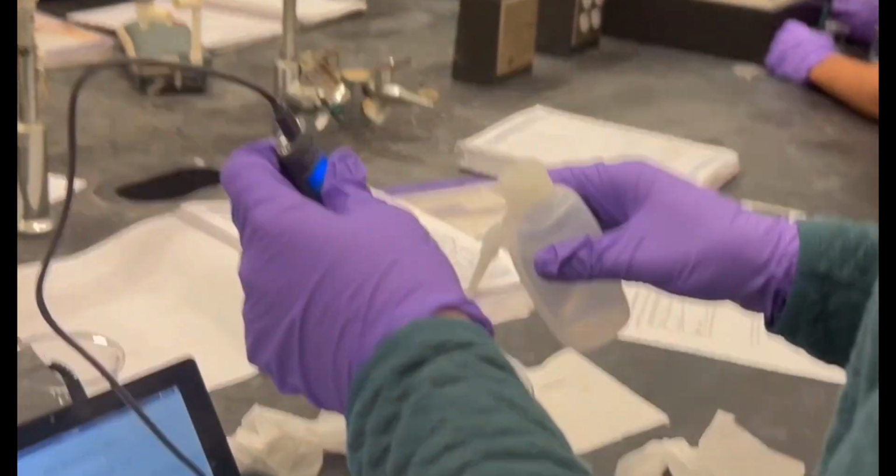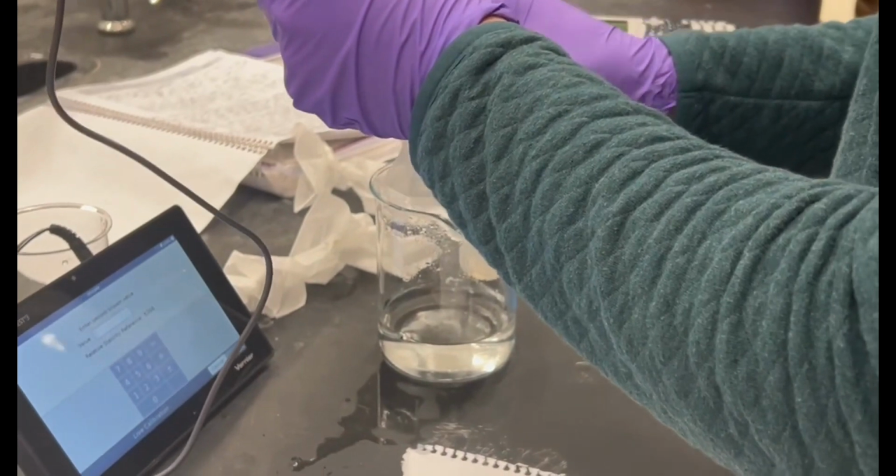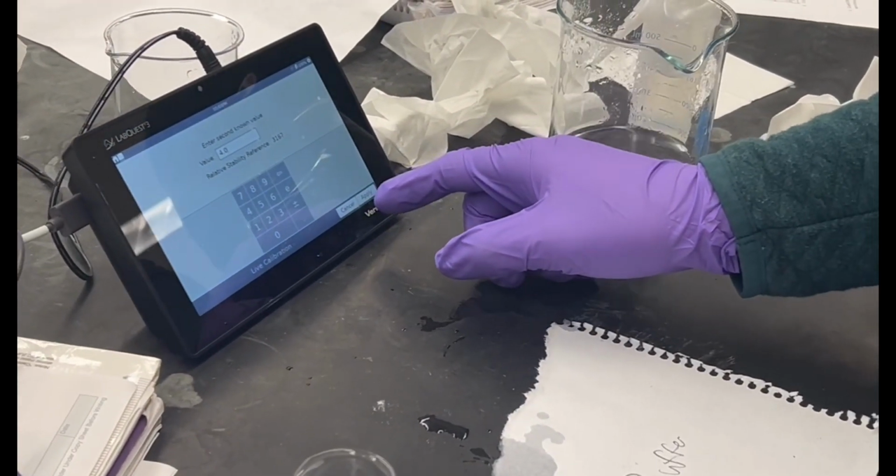Then you will rinse it again and then place it in the pH buffer of 4. Once the pH meter stabilizes again, you type in 4 and apply it.